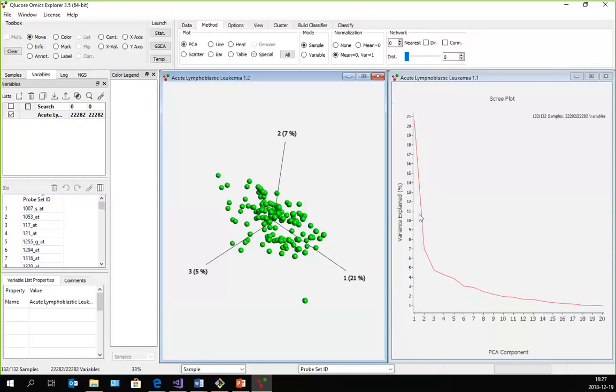But the problem with this kind of plot is that variations in the higher dimensions are very hard to see, because as you see here along this line, it gets smoother and smoother, but it really is not the truth, because there's quite some variation between these higher dimensions.